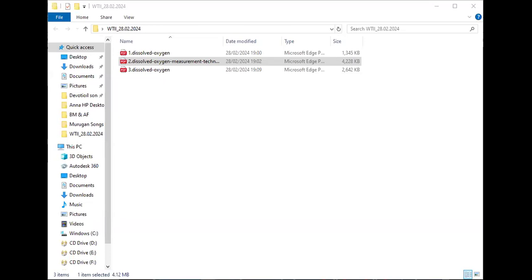A titrating test is normally called the Winkler test, right? There is some human error, corresponding to the skill level of the person performing the test, oxygen being introduced to the sample at the moment of sample retrieval, and the titration solution not being in optimal condition. Those are some types of tests. These are the types of titration.